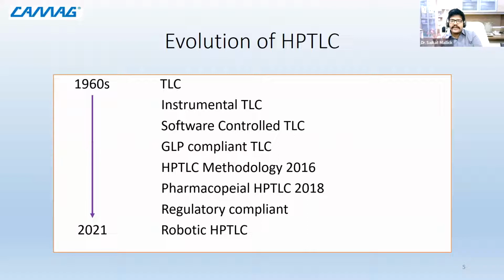It started in the 1960s, where originally the idea of TLC was a benchtop technique. You had a wide variety at that point of time, you did not have much of a choice. Maybe filter papers used to be there, and some handmade silica plates people used to make, and on that they used to put the spots, get the separation, and that's it.